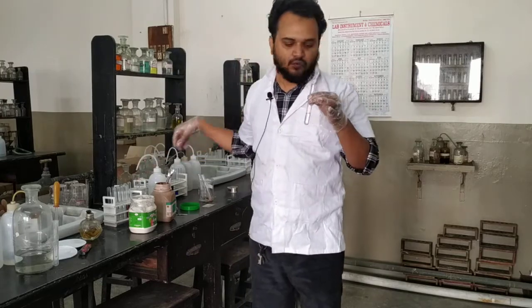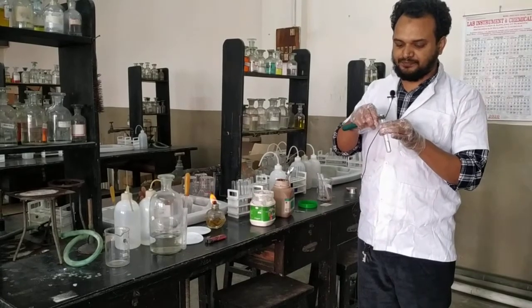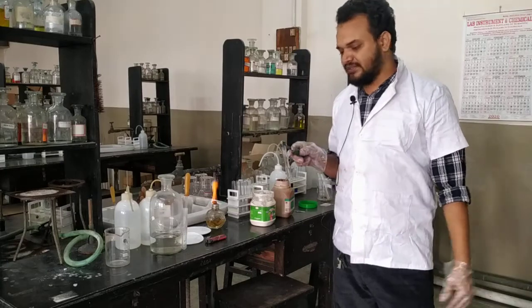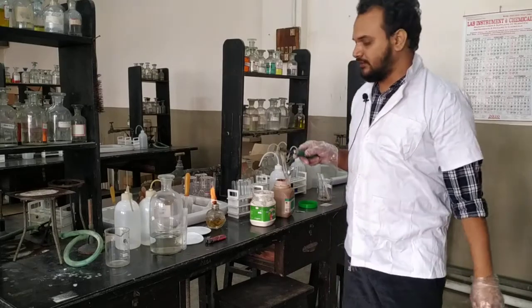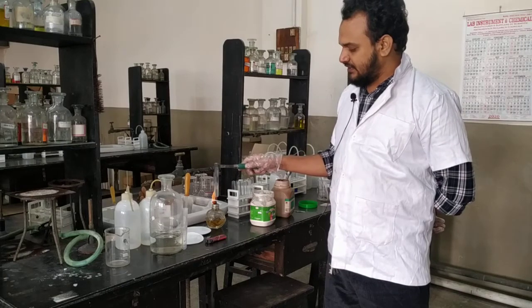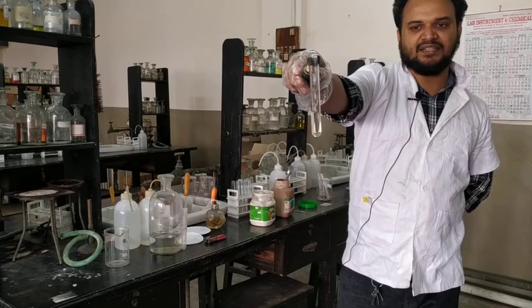And now I have to warm it. Warm it until you get a grey silver mirror. Not only silver, a silver mirror. That means it will be so shiny at the wall of the test tube that you can see yourself, like we see ourselves in the mirror, at the silver that gets adhered at the wall of the test tube. But you have to be very patient for all the practical experiments and patiently heat it. It is a clear solution, and slowly it will give you a dark solution, and at the wall of the test tube you will see the shiny silver mirror.